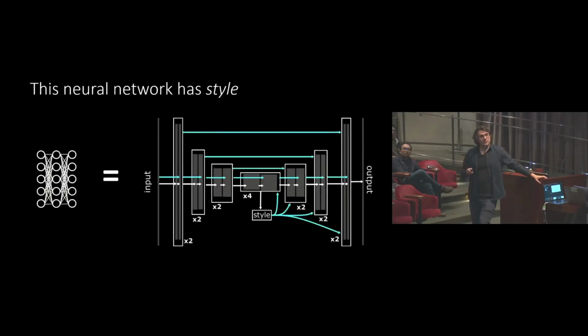I'm not going to tell you a lot about how the neural network is structured. It's a fairly classical standard UNet architecture. It has a few embellishments here and there to make it work as well as possible.